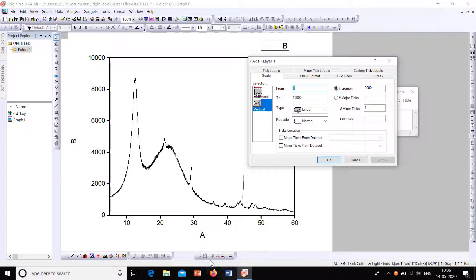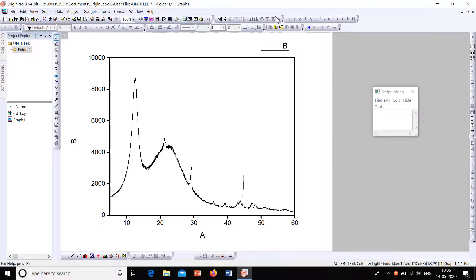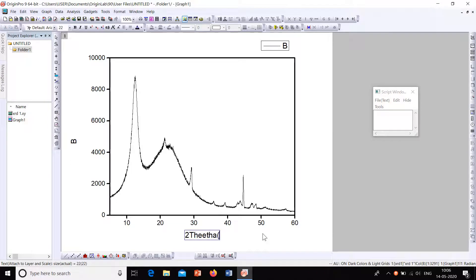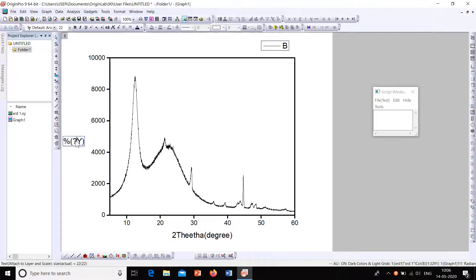The axis beautification is done — click OK. Now we can give the axis names. Select the X-axis label and type '2 Theta', and in brackets give the units. For the Y-axis, the name is 'Intensity' and the unit is 'arbitrary units'.